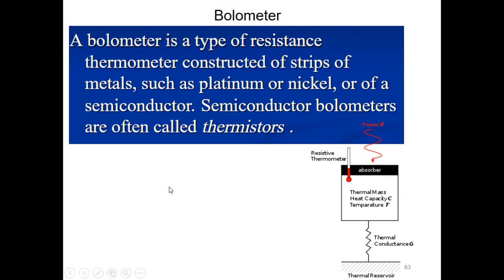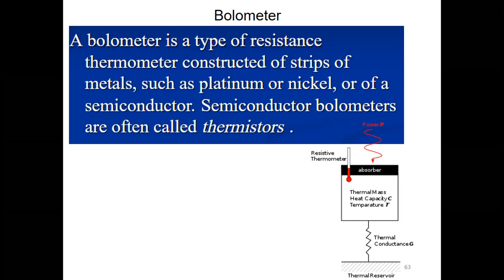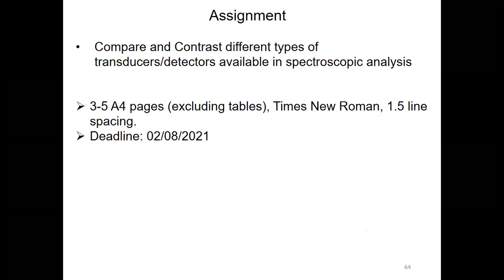The bolometer. And I am not expecting these thermocouple and bolometer things in much detail, right? So just have a brief idea of what is happening in the thermocouples and bolometers. Okay, so those are the transducers. We discussed the two types of transducers and the examples.